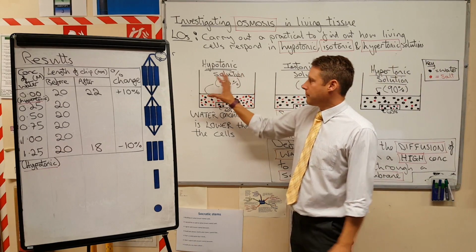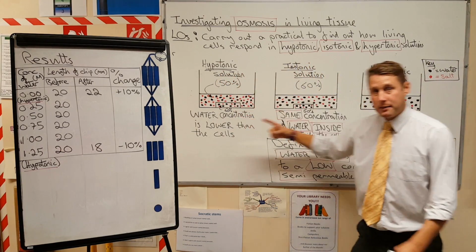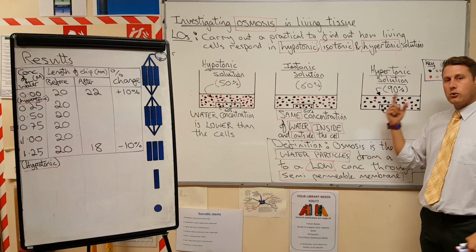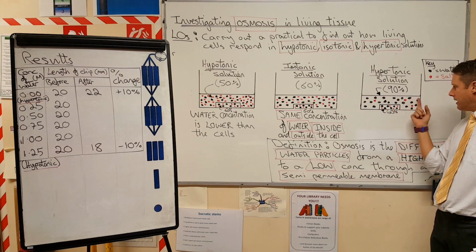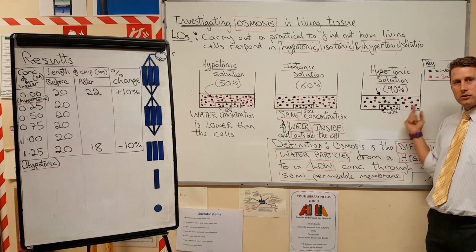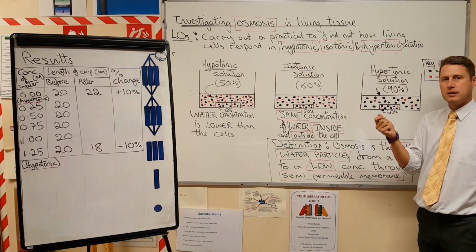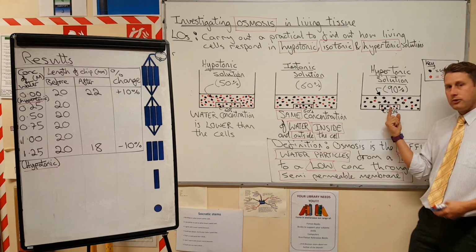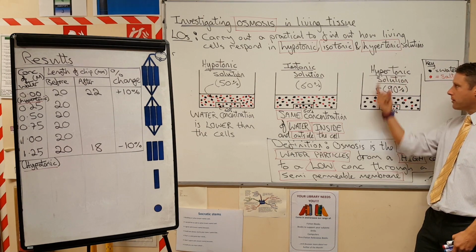So we likened it a little bit to being in a bath or a swimming pool. Being in a swimming pool, you're in a solution which has lots of these water particles in and very little dissolved substances compared to your body. And we've actually put some potatoes into tap water. And this is our model that we drew up.